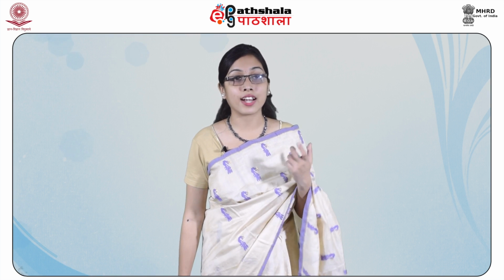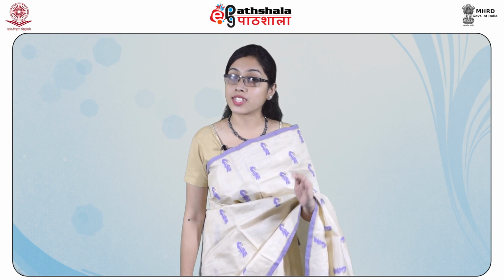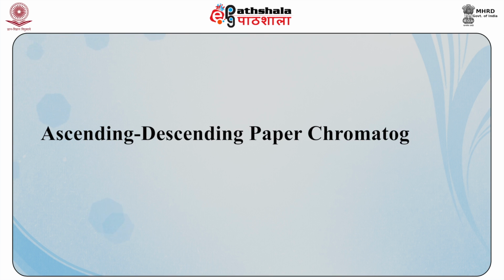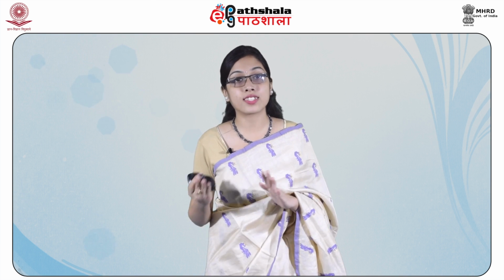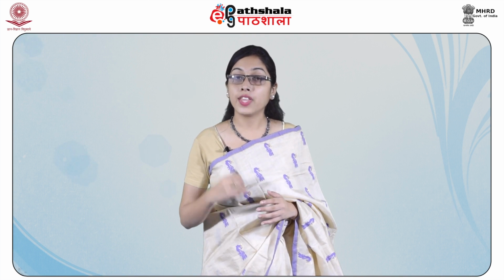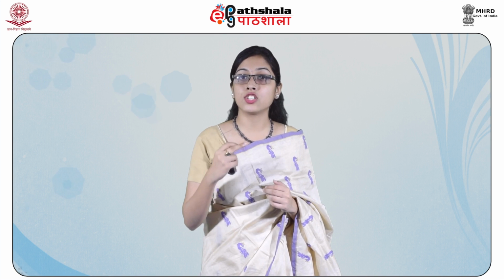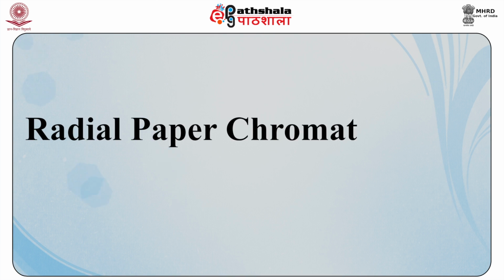The mobile phase is kept in a trough located at the top of the chromatographic chamber and it is allowed to descend over the chromatographic paper. Next is ascending-descending paper chromatography. It is the hybrid of both the ascending paper chromatography as well as the descending paper chromatography. The upper portion of the ascending chromatography sheet is folded on a rod while allowing the descent of paper after crossing the rod.